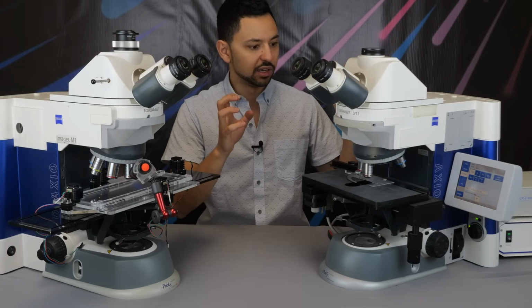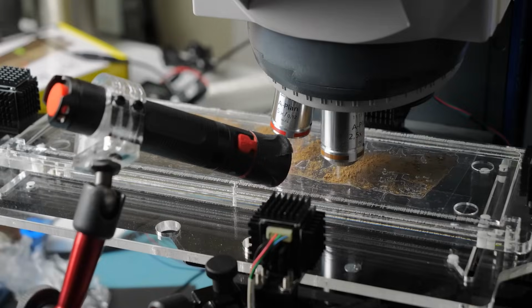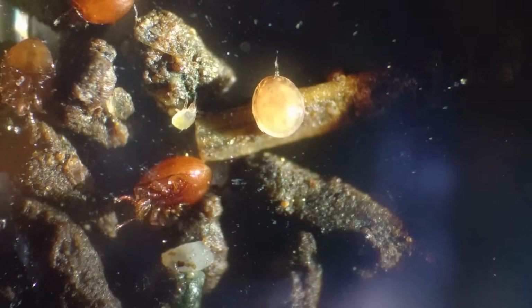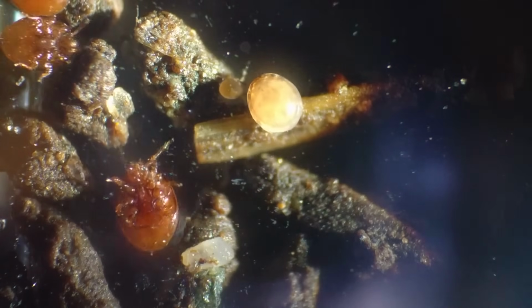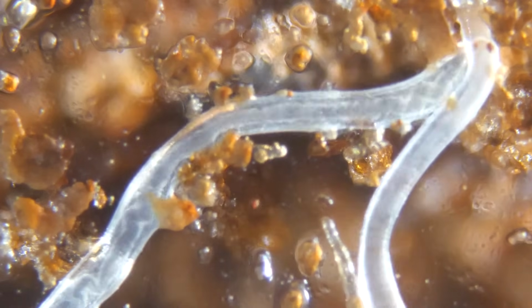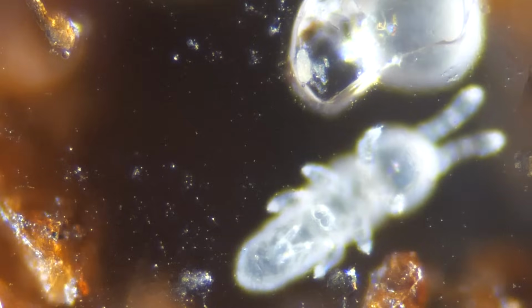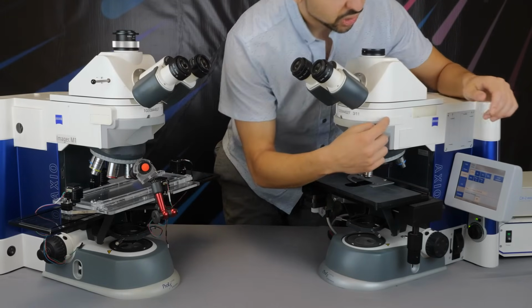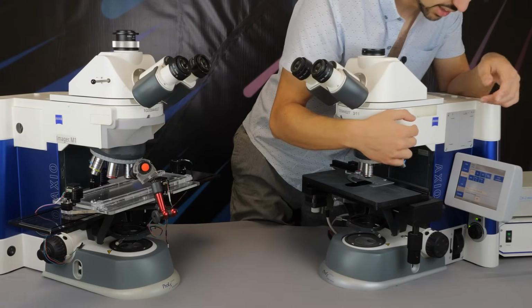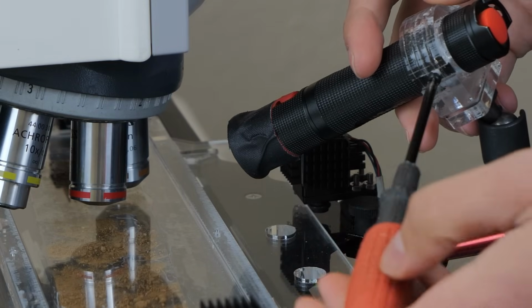So some of the best parts of the microscope are, number one, the optical train is extremely good. This is what I use to film my welcome to the Micro Safari videos, any other microscope related videos. Typically using this, I put my mirrorless camera up top here. These are made to be universal microscopes, meaning that there are all of these ports and little areas that you can take out to add filters.